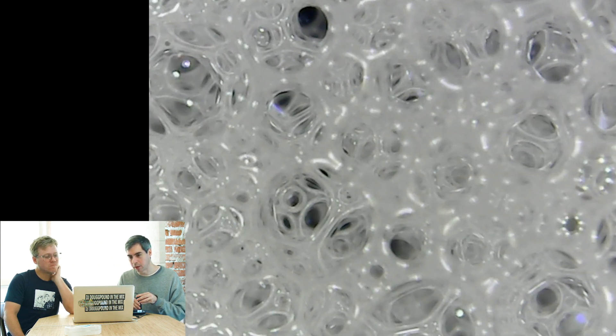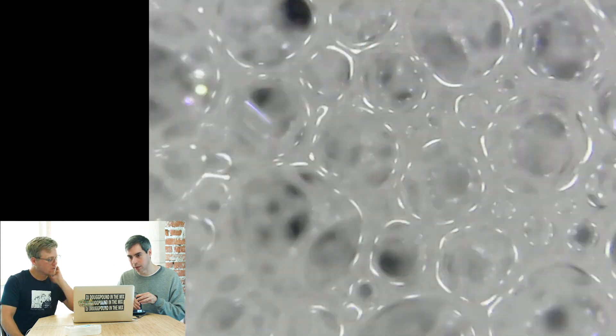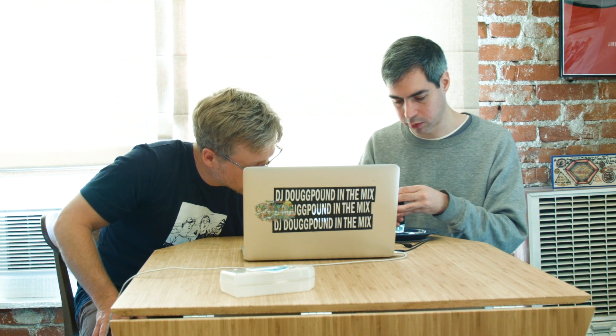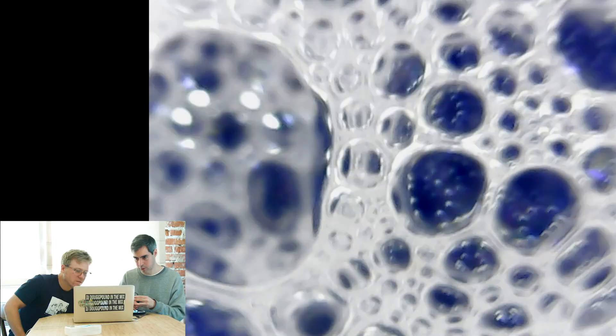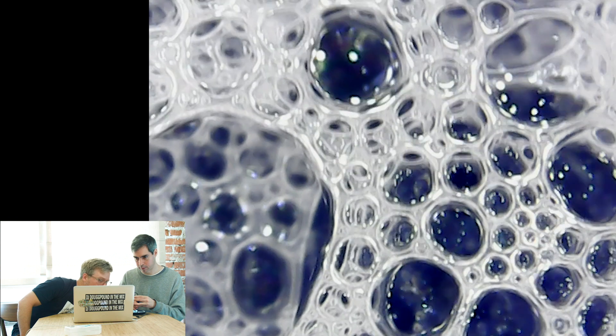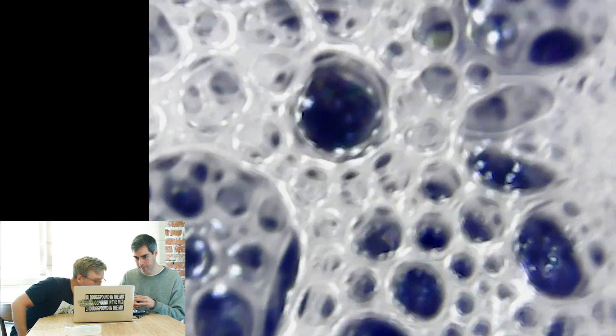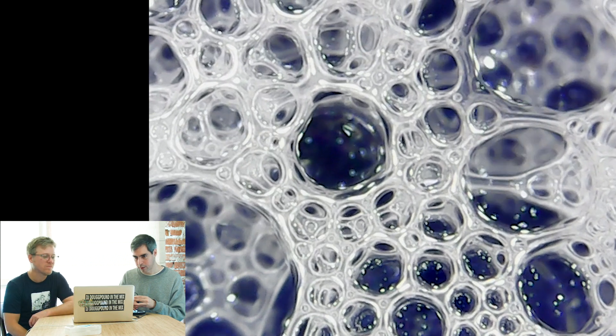There's not a lot to explore, but it's just a cool thing to see up close because you do not see that. I'm just going to get really close too. What if I blow on it? You think they'll pop? Get some action? Let's see. Should I lift up and go on the dense part? And tilt. It didn't really... it did do some stuff. Yeah, but they're not popping. We want to see some... look at that. That one should pop soon right there. See that?